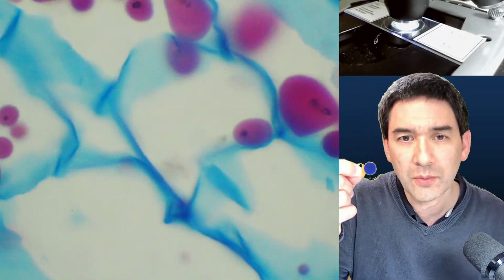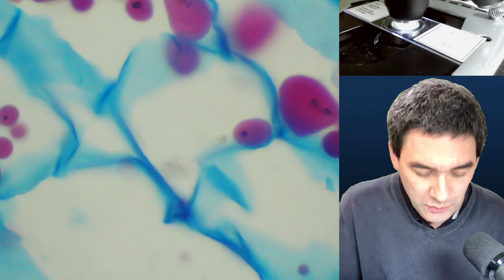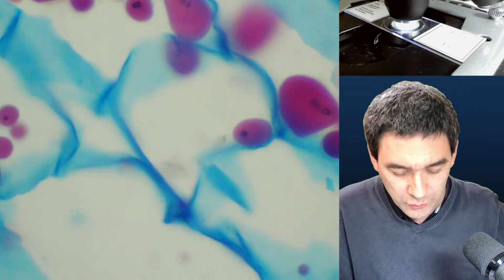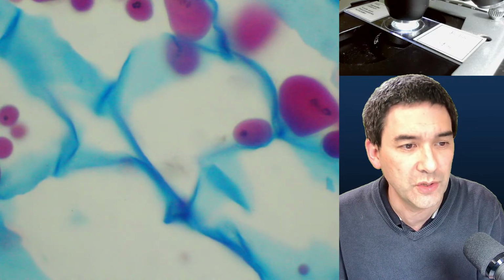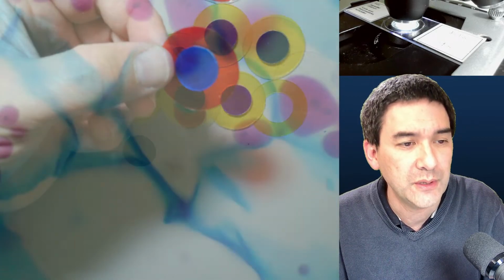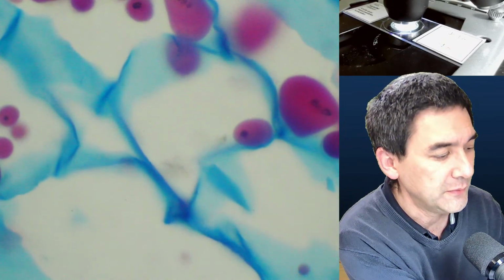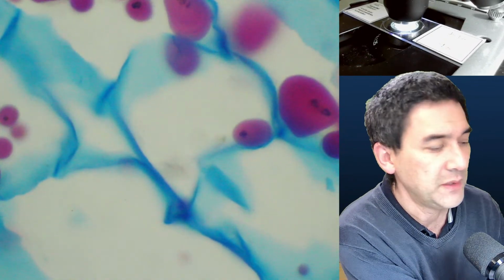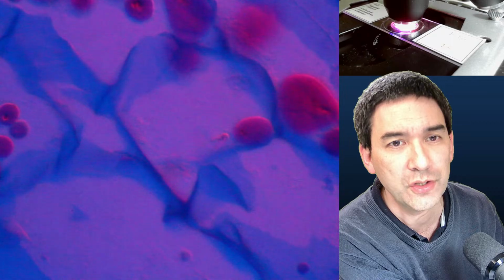So the filter that I used in this case was a blue-yellow one. What I'm going to do now is try the red-blue one. I just show this to you here. That's the other one. I'm going to try to use this one now. I've got about 10 or 12 slides that are prepared. I have to insert this, and of course it's going to be quite dark, so I have to turn up the light and find the correct position here.